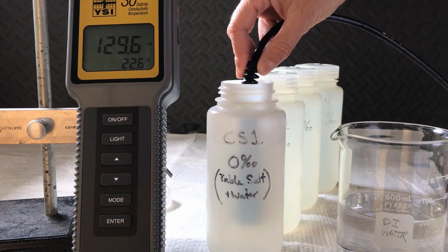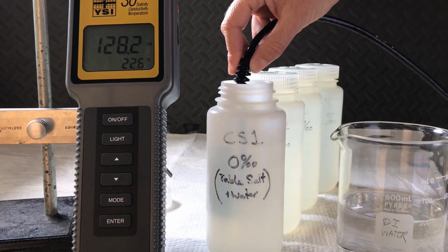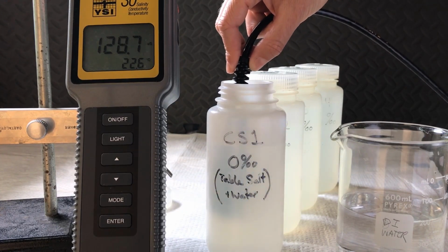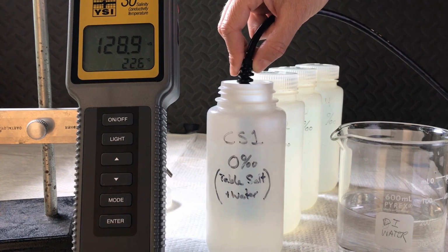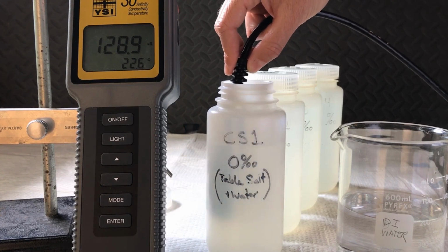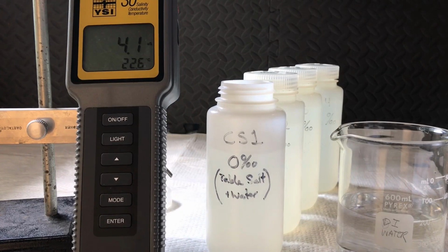It should be very close to 0 when we convert it to millisiemens. We'll say the conductivity of calibration standard 1 is 128.9 microsiemens. We'll convert that to millisiemens in the lab.